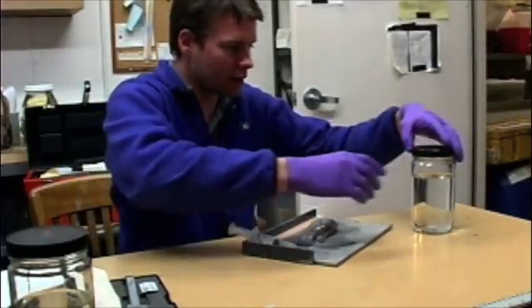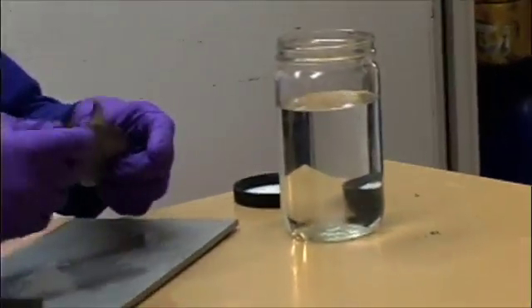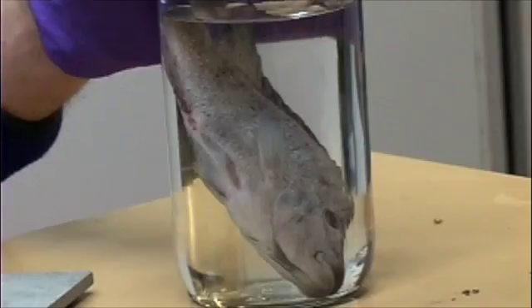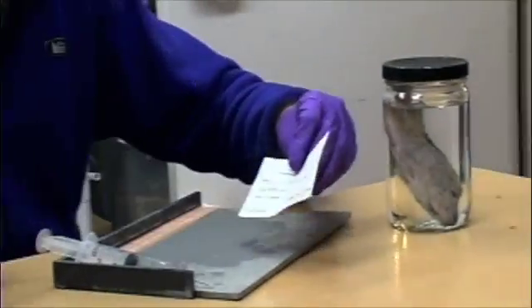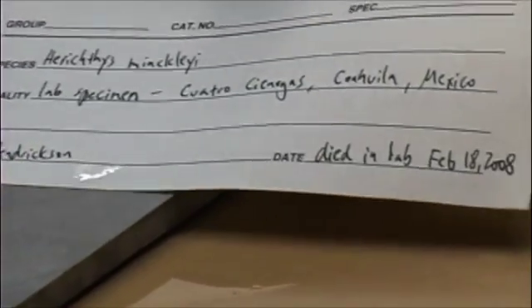This fish is now injected with formalin. After injecting the specimen, I'm going to preserve it from the outside by dropping it into a jar of formalin and putting the lid on. I'm also going to put a label in. It's very important that we keep data associated with the specimen at all times — we never want to put a fish in a jar without a label.